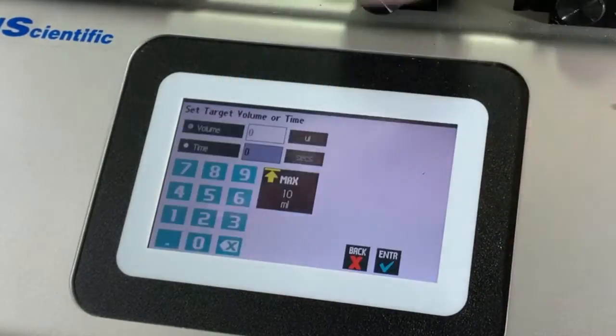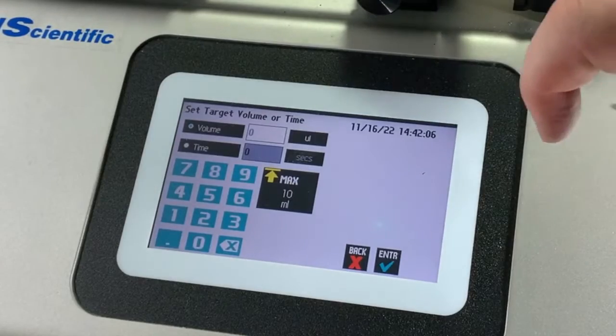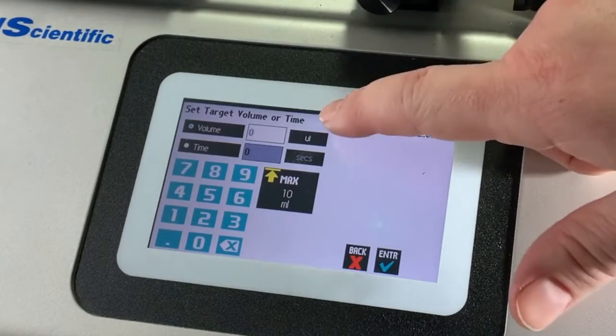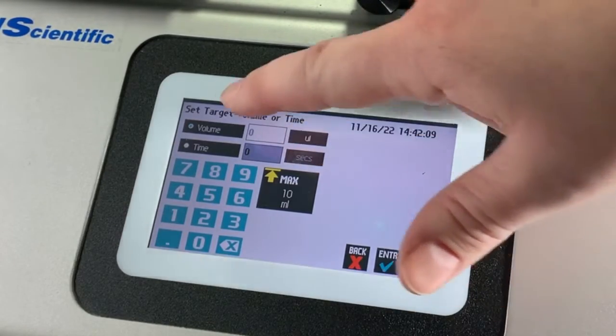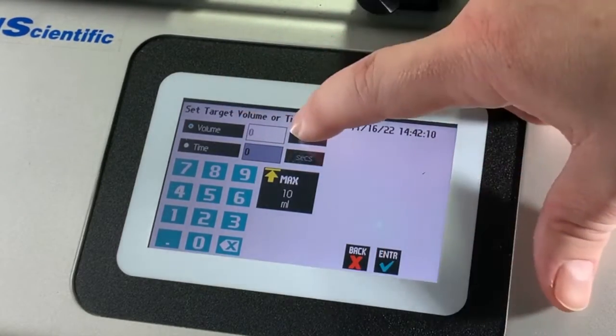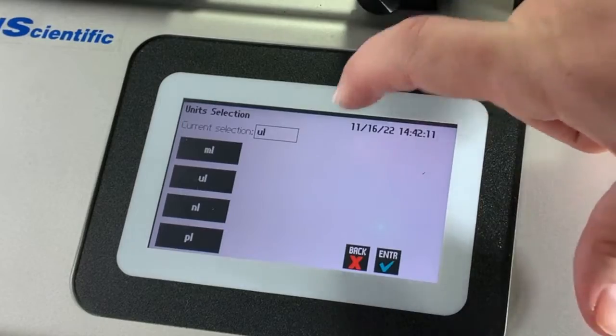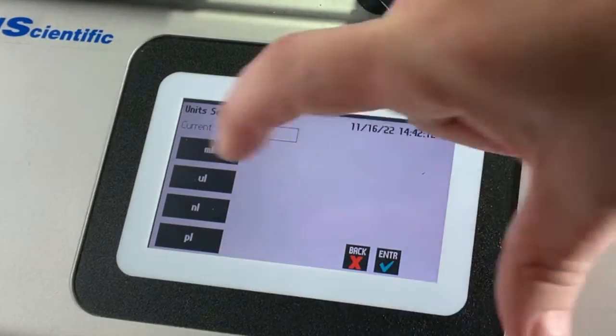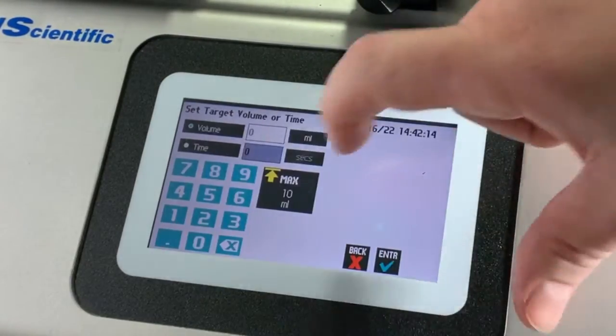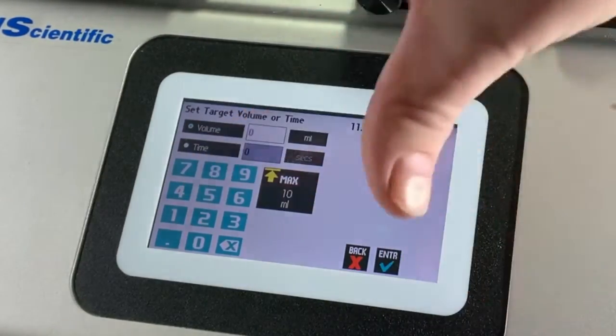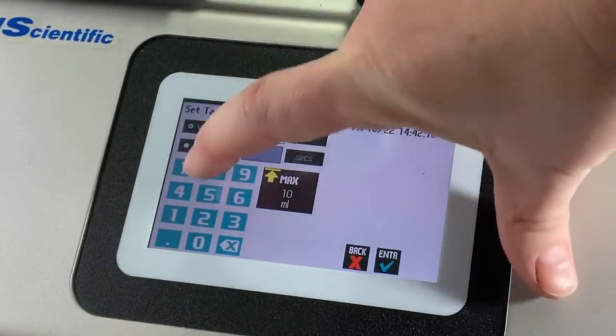The final parameter which needs to be defined is the target. Now this target can be the total volume you wish the instrument to dispense, or the total time over which you need to infuse volume.